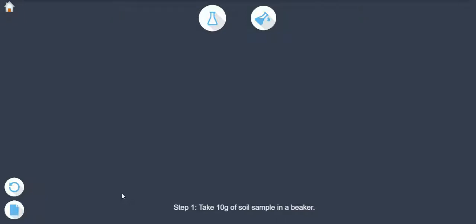Step 1: Take 10 grams of soil sample in a beaker.